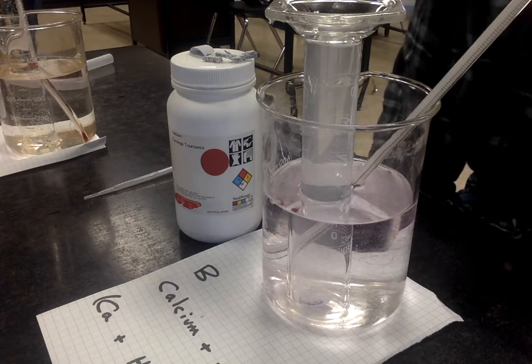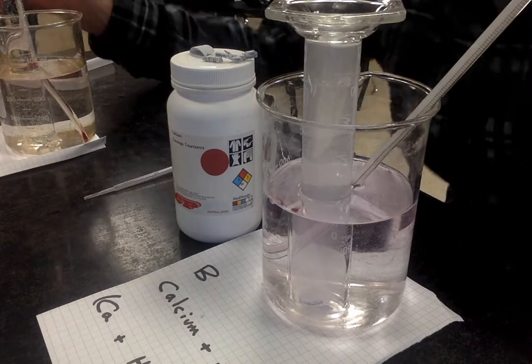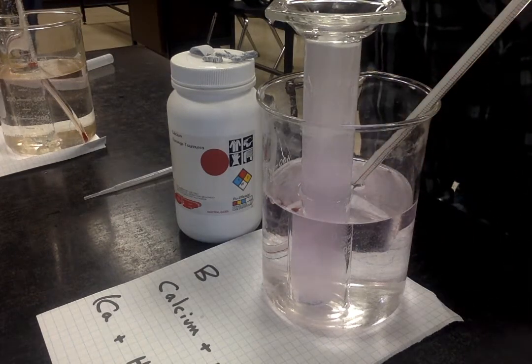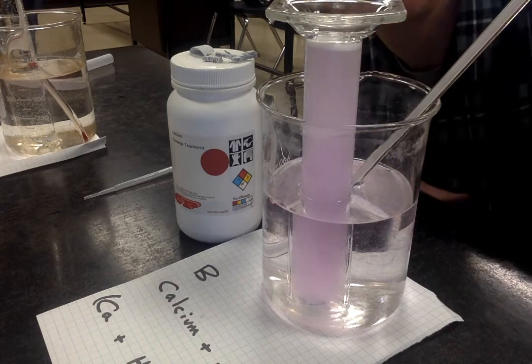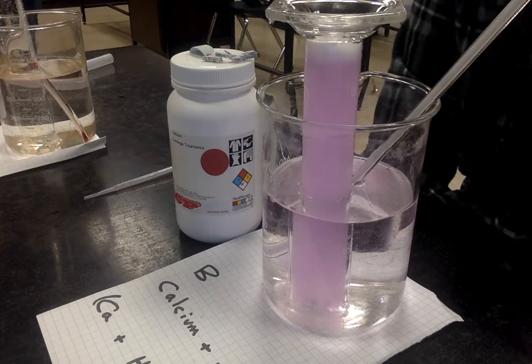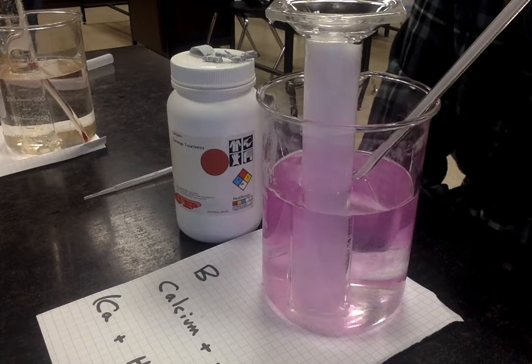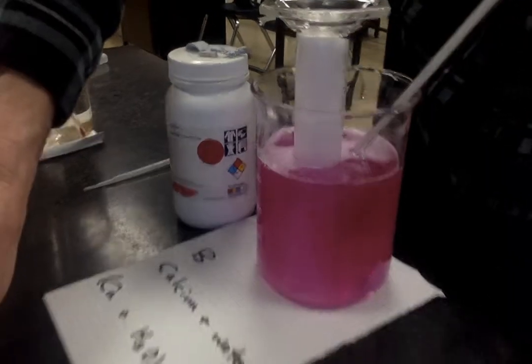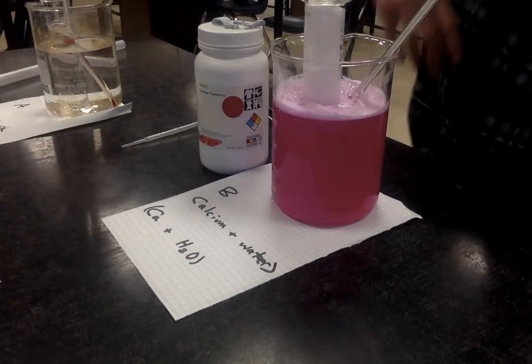No gas is being produced in the zinc beaker, and the temperature in the zinc beaker remains at 20 degrees Celsius. The temperature in the calcium beaker is 21.5 also. But look what's happening. We have a gas that's being accumulated. This is happening a little faster than I might have expected. A gas is being accumulated in the calcium beaker also.